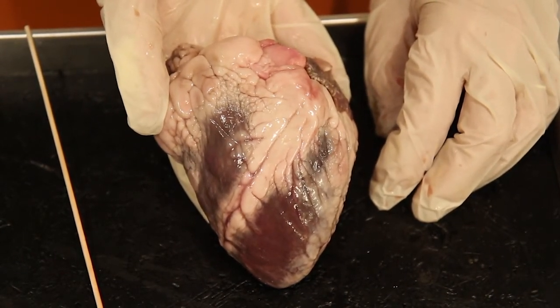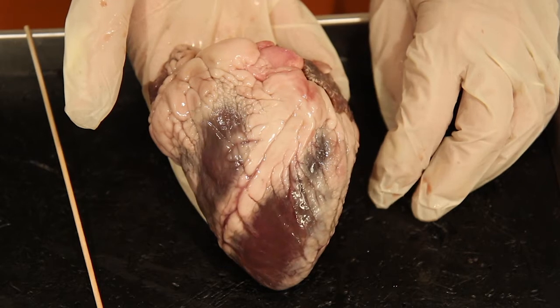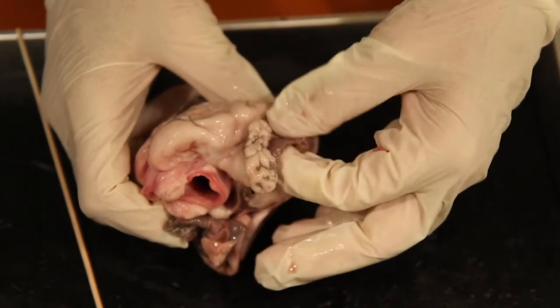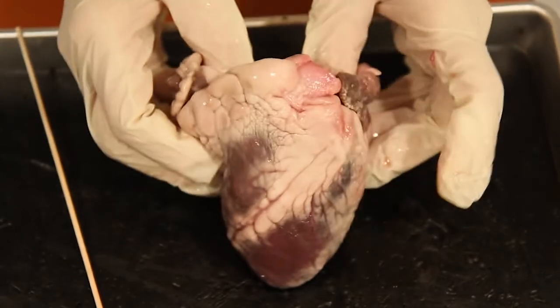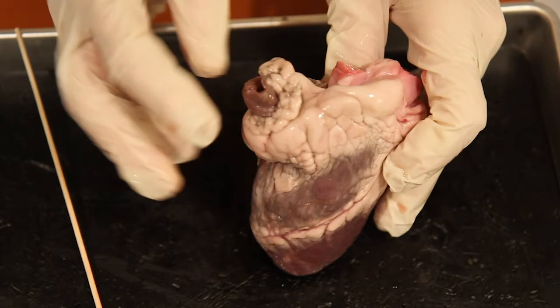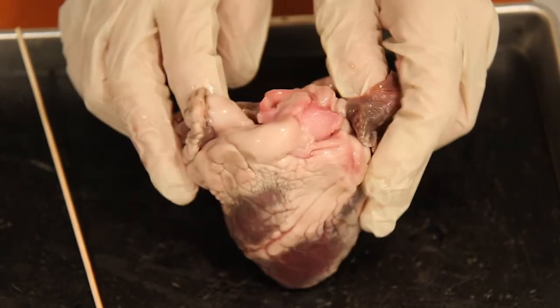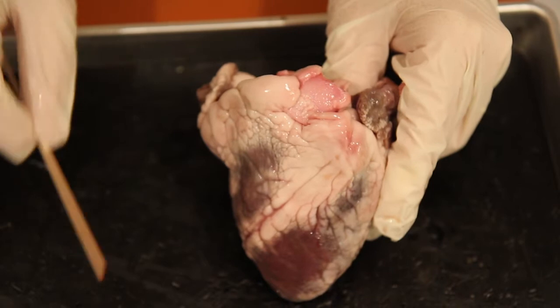Next it directs us to look at the auricles, which are the visible portions of the right and left atria. Sometimes at the slaughterhouse they cut these a little low, so we'll only see a small section. In the anterior position, this darkened area would be the left auricle and this on the right would be the right auricle of the atria. If I put my finger in here, I'm coming into the atria.